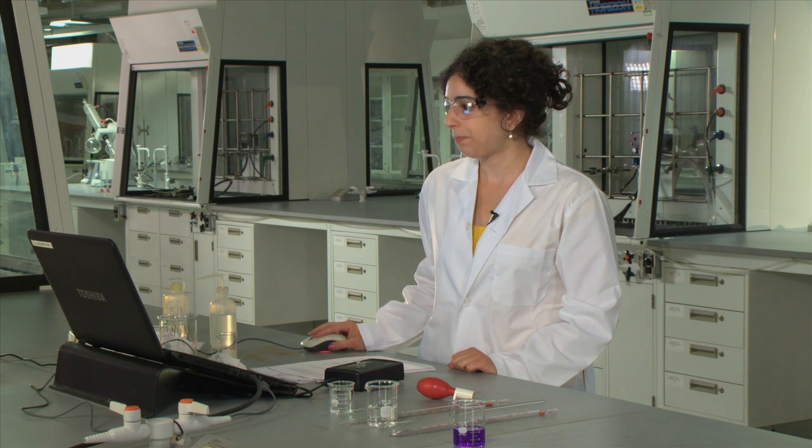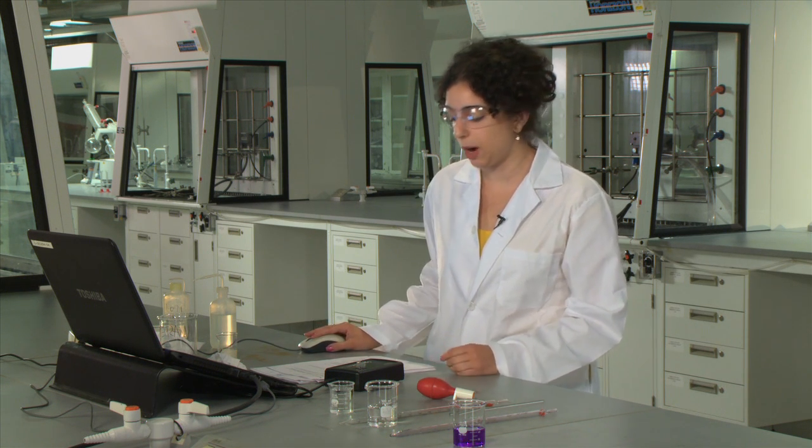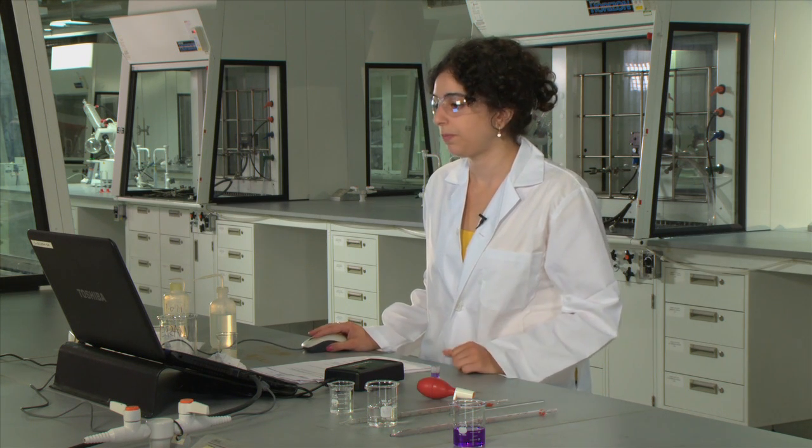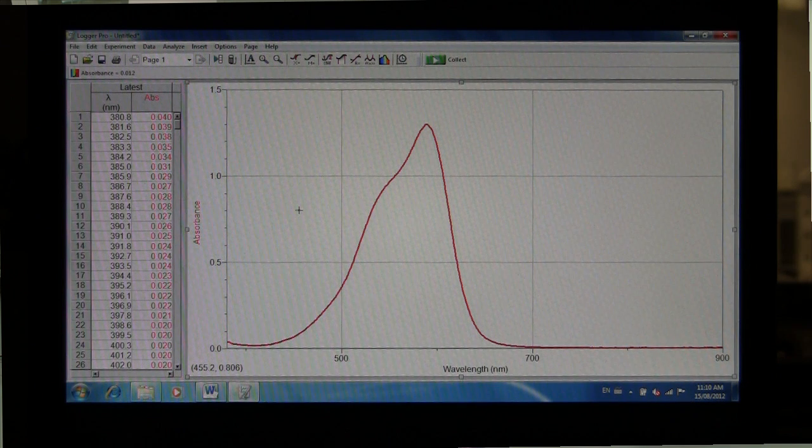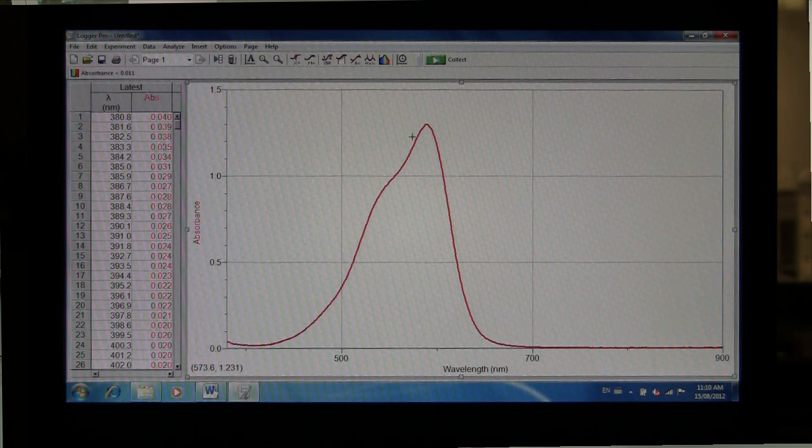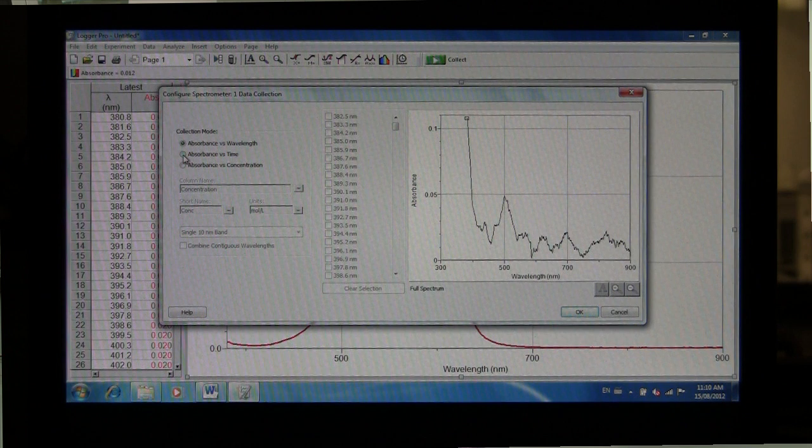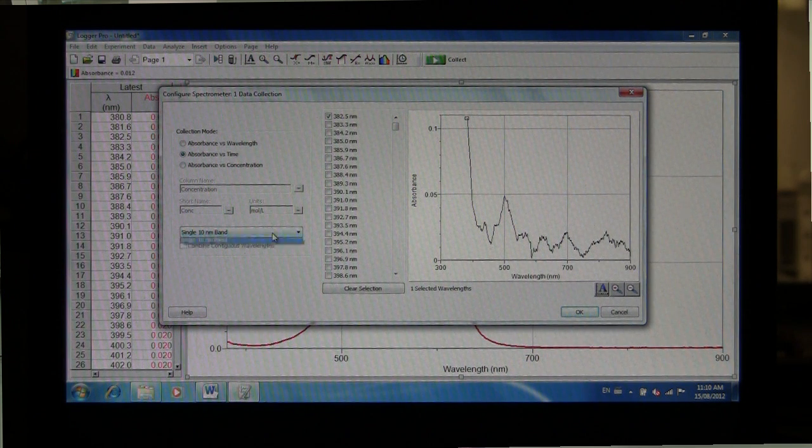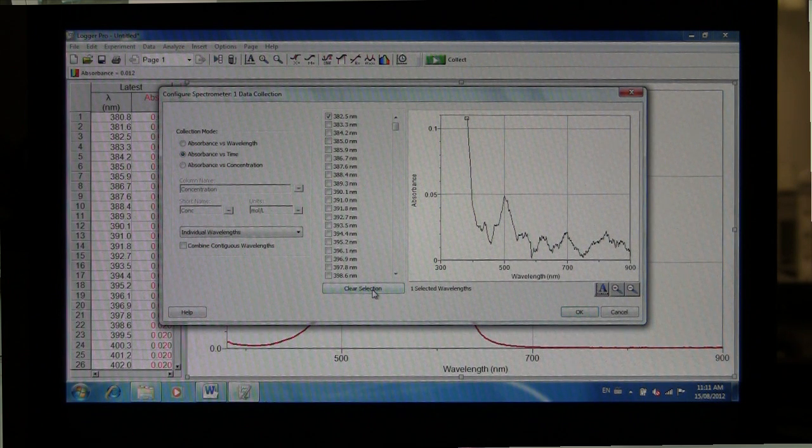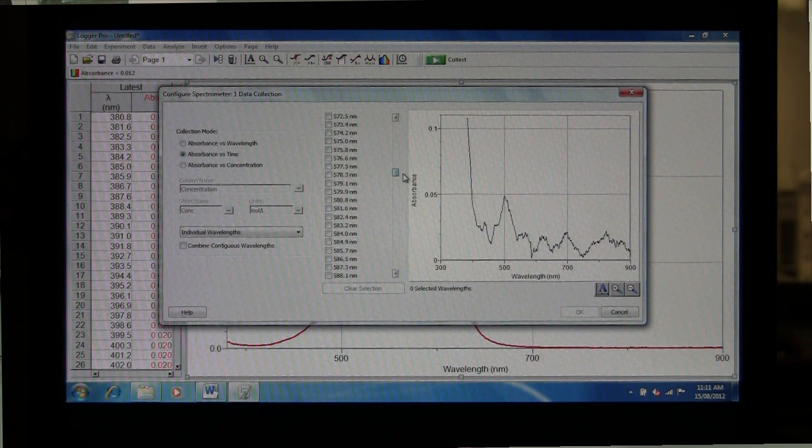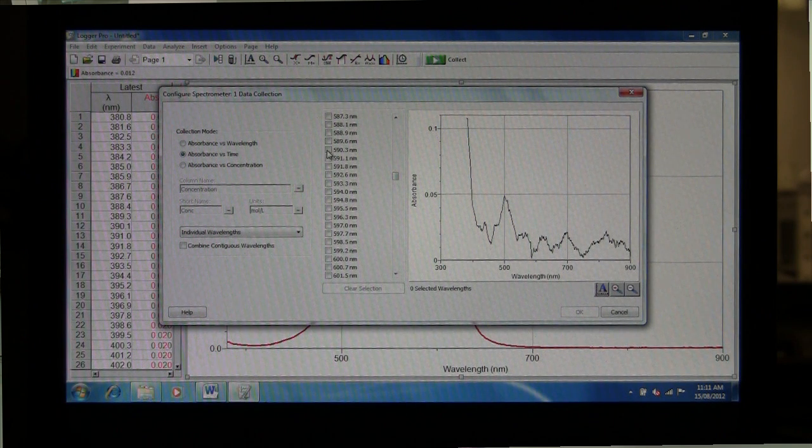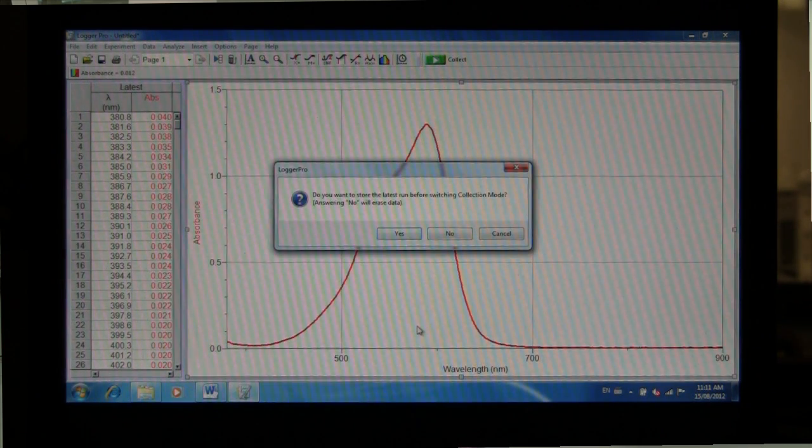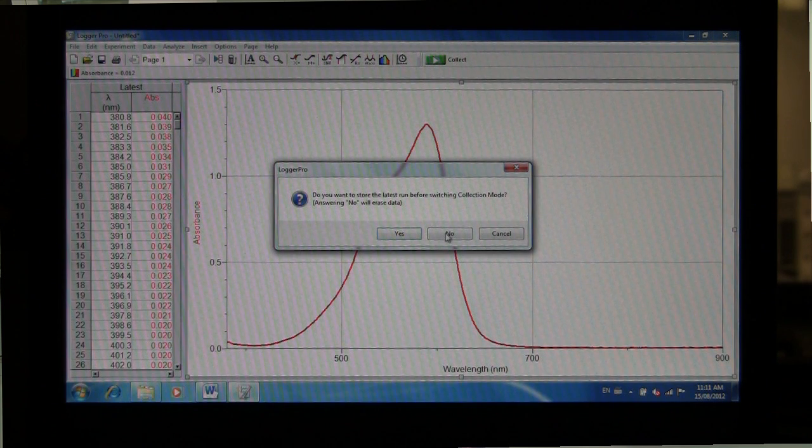Once you have collected your spectra, you're going to want to then set up your graphs for your next experiment. For the next part of the experiment, we're going to need to configure the spectrometer so that it is running at our maximum wavelength. To do this, we go to Configure Spectrometer. Under Collection Mode, we're going to check off absorbance versus time. In the drop-down menu below, we're going to select Individual Wavelengths. Clear any current selections that we have in this list, and we're going to scroll down to around 590 nanometers. And then click OK. If you get a message that pops up asking you about your latest data collection, since you've obtained the spectra and pasted it in Word, you can click No.